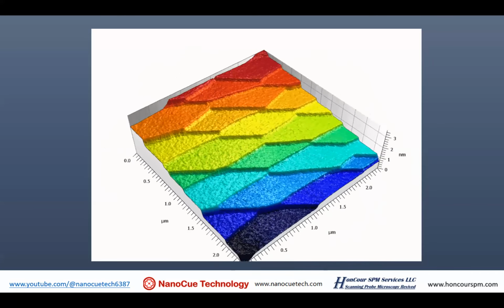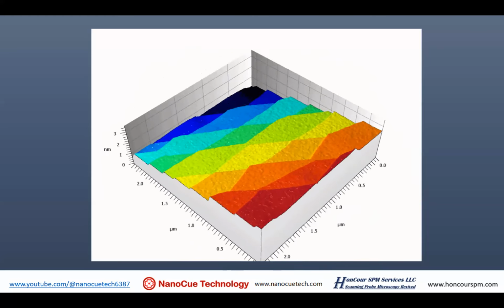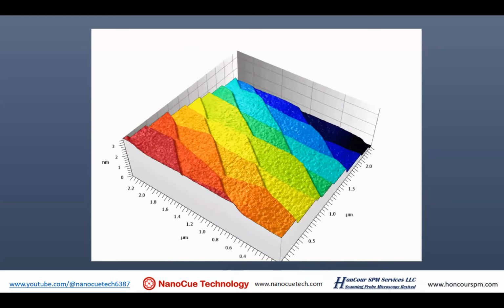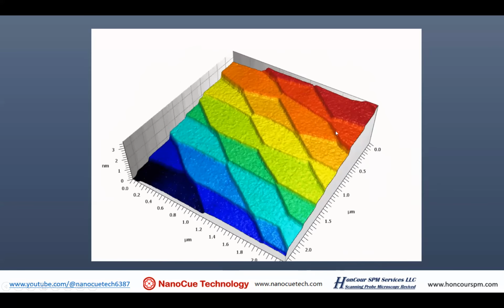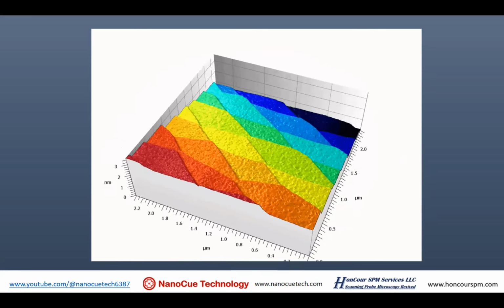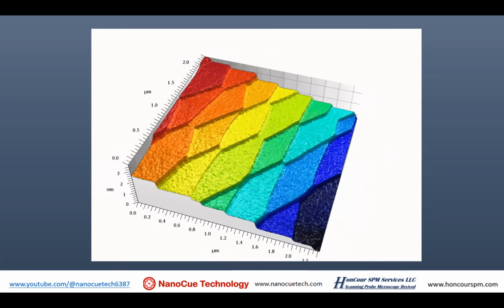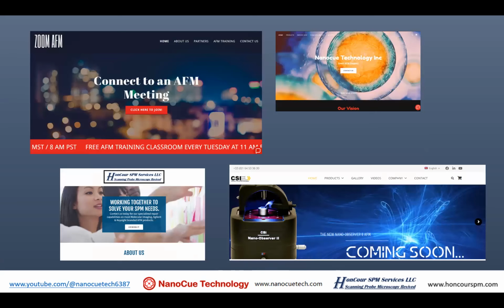And this is one of my demo data. When I say demo data, it's when people show up with a sample and they get their result within 1 or 2 hours. So we don't have time to re-prepare the sample. All we did is put it in isopropanol, image in liquid, and then increase the force set point so the contamination is wiped out. Simple.